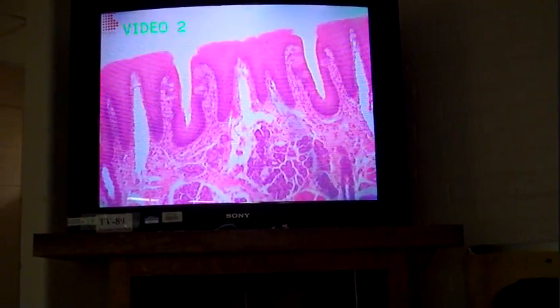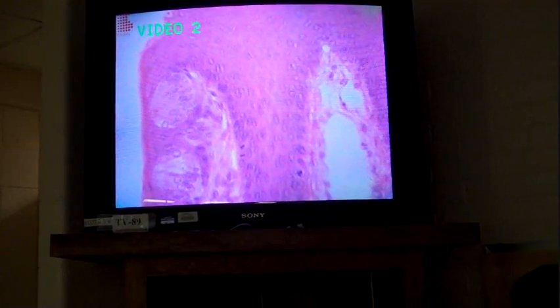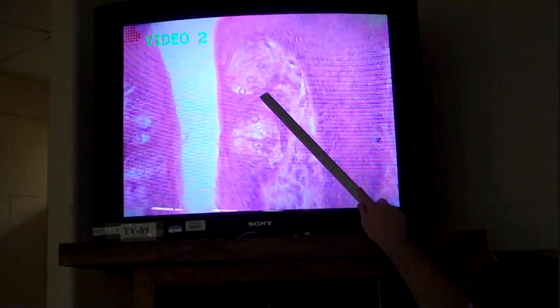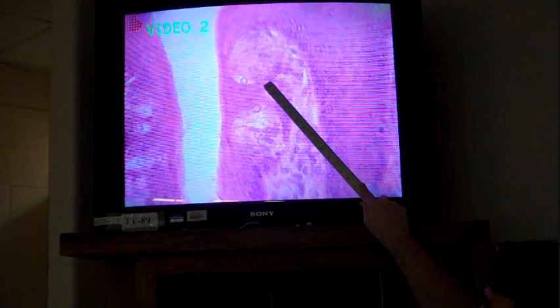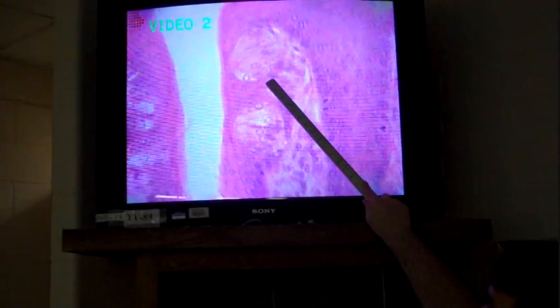If you start to magnify this and really look, you can see the taste buds a little bit better across the sides there. If we go all the way up, you guys should probably wait until we actually focus it. That'd be a good idea. You can actually see the rounded structures on the side. That is a taste bud. A taste bud, yes.